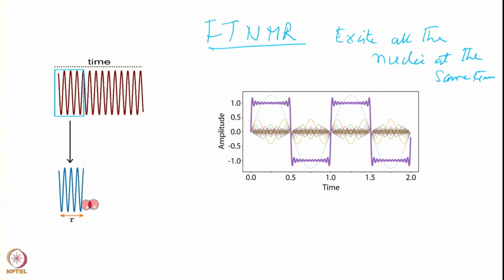This looks very similar to this here, except that I start at a particular point, with only one frequency going, and then I stop it and truncate it. So it goes for a short period and then is truncated, comes to 0, RF goes up, goes for some time, then comes to 0. So you produce a pattern like this. I choose only one particular portion of this, which is a small amount of time.